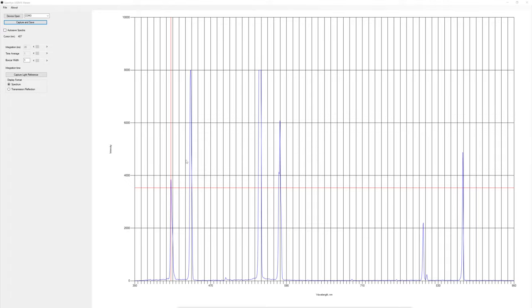Right, that central line here is coming up as the light is warming up. That is in the visible spectrum, so that might just be warming up. So, I think we will call that a day.